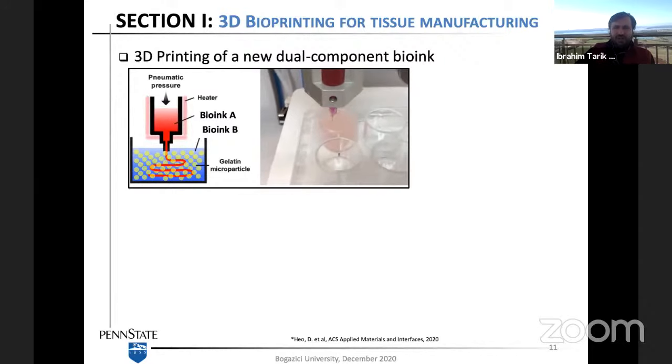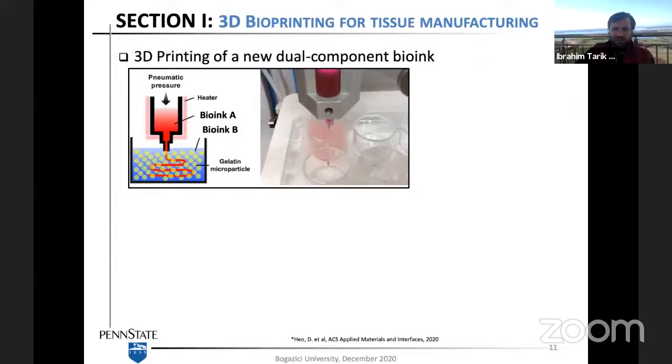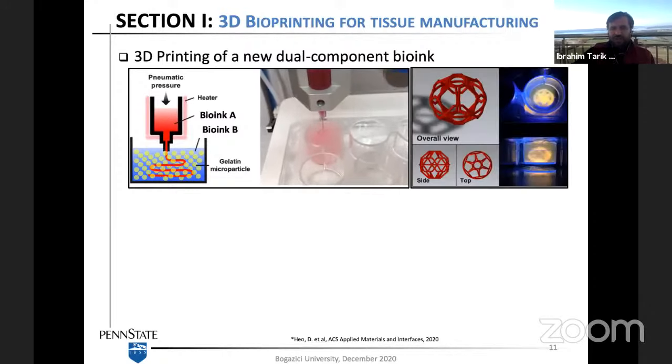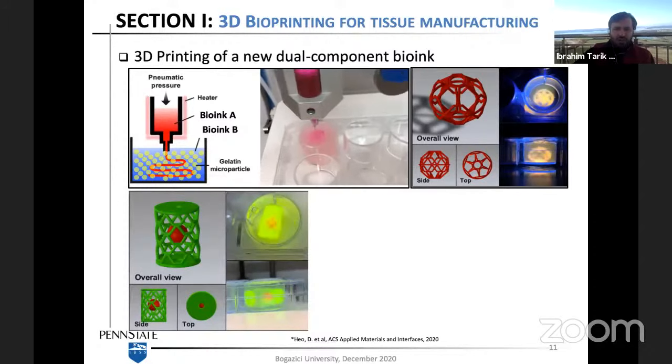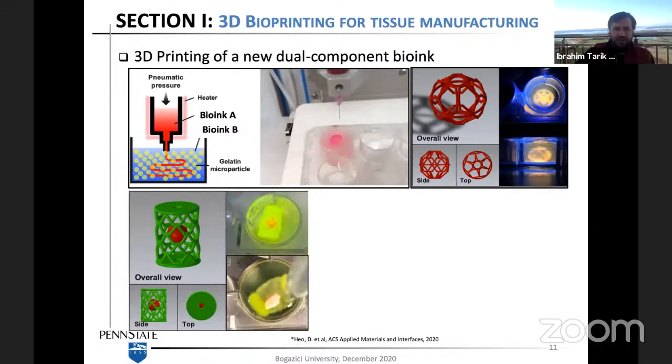So you can't really see it now because it's not really super transparent, but the red material that is being ejected is being written now, is being deposited and then printed in 3D. So now you can better see. But at the end, what we get is various different complex structures like these cages, you know, cages with a ball, where the ball is rotating freely inside this cage.